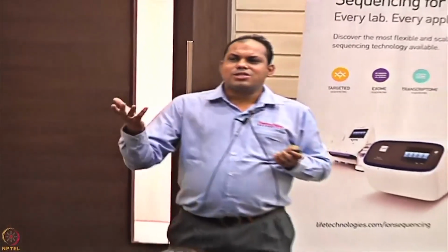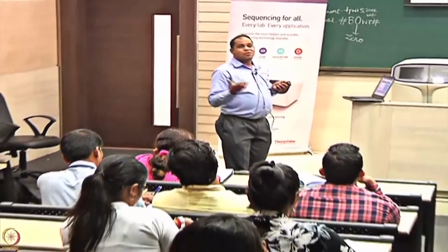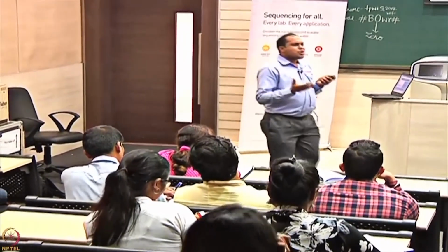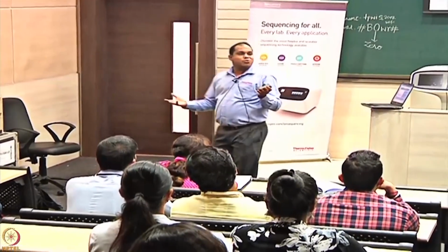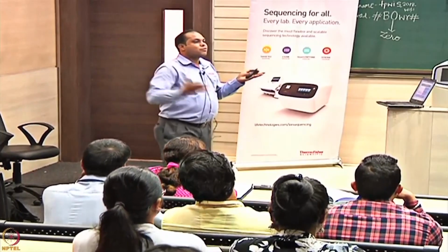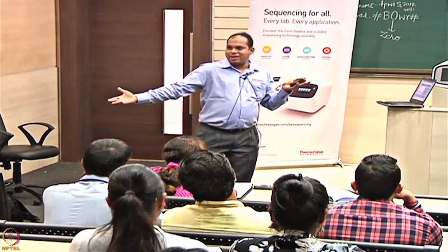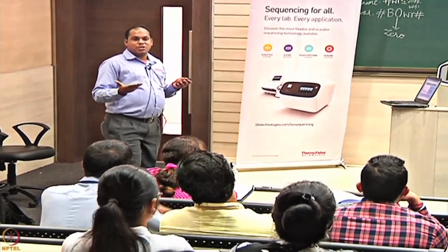So this is nothing but a study of genes which are expressing in your samples. Or you can say, if you are considering something like a cancerous patient and a normal patient, you would like to know which genes are expressing in a cancerous patient that are very much different from what the normal patient is having, right? So such studies come into play when you talk about whole transcriptome sequencing.